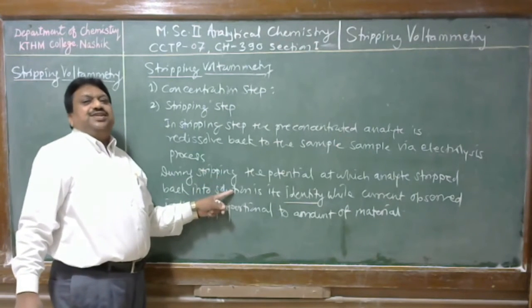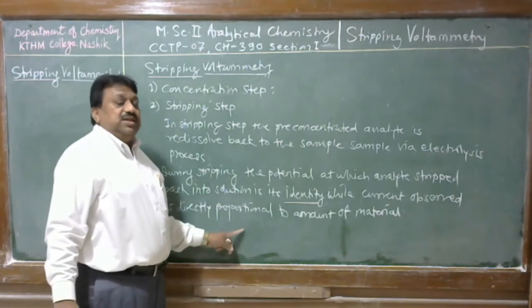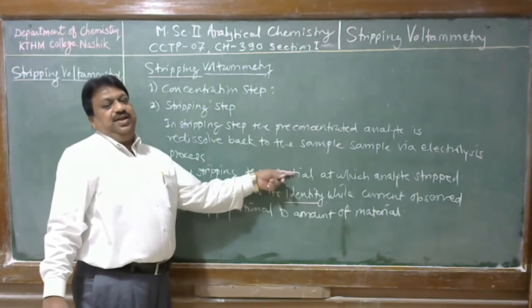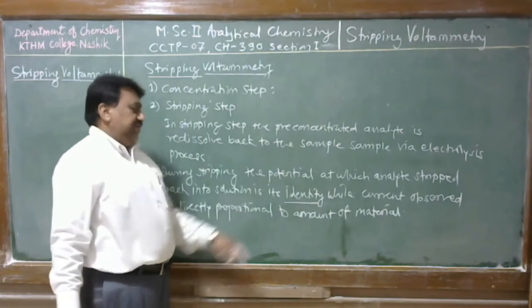During this, potential scan is in opposite direction, but this potential is scanned linearly from the reduction potential to oxidation potential, or oxidation potential to reduction potential.